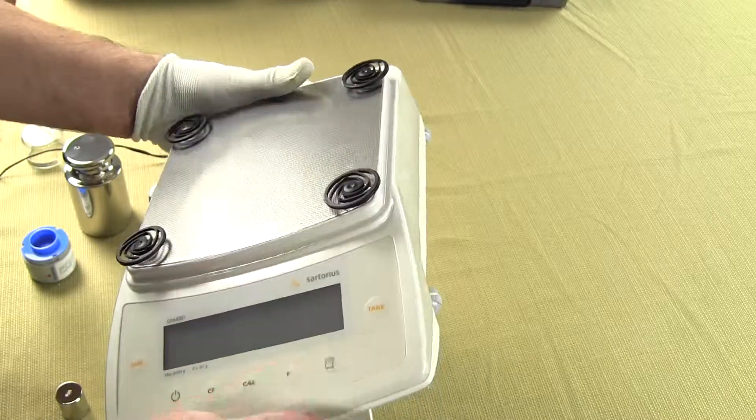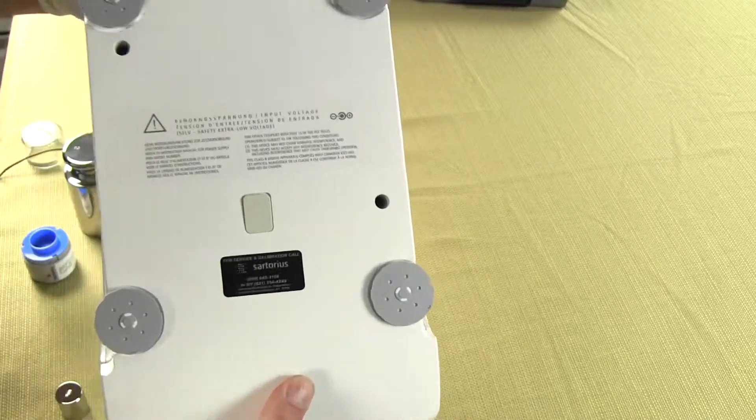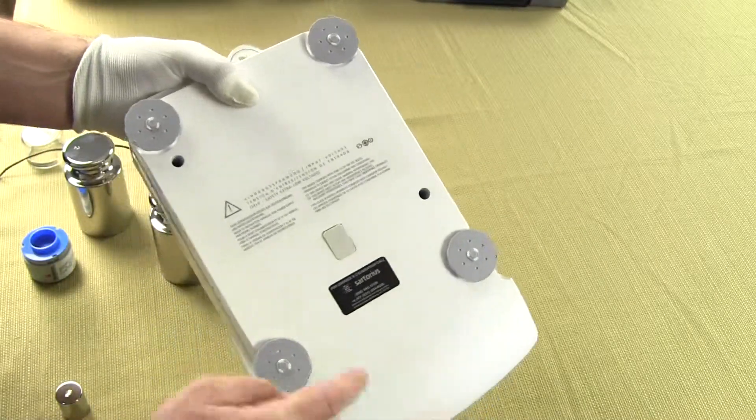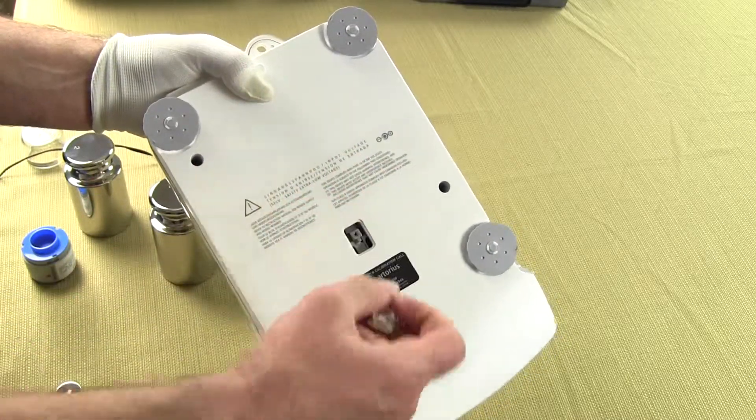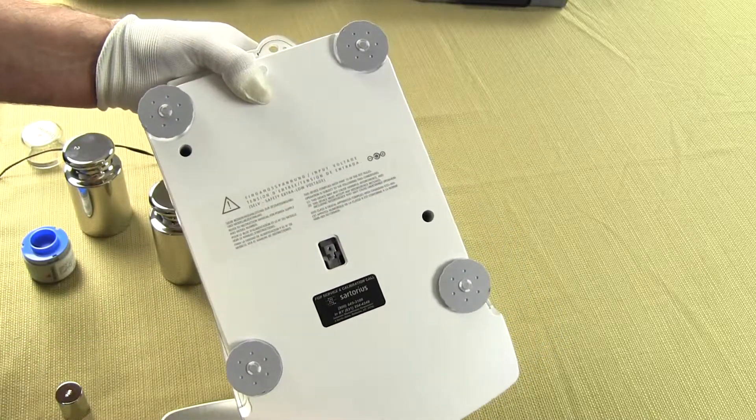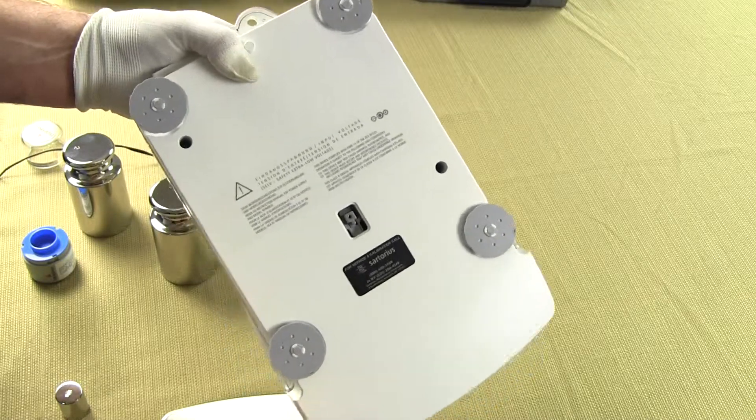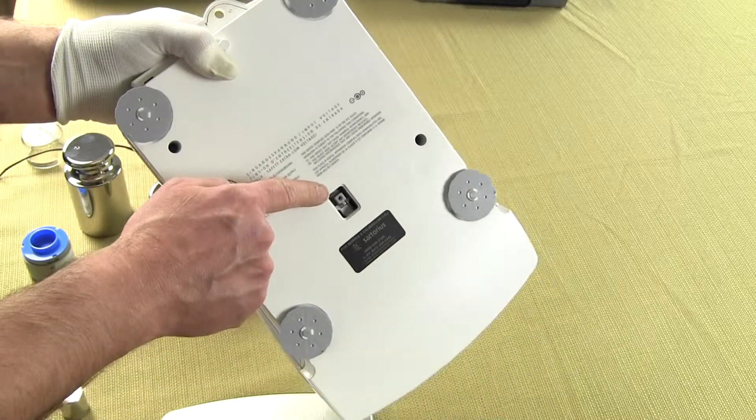Beneath the balance you have four adjustable feet. So on this tenth of a gram balance CPA series you have four adjustable feet. Now here this is the way below hook.